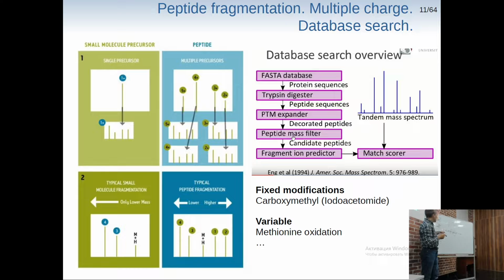Also, if you know that there are a lot of amino acids which have a really low chance of ionization, can we just skip them as improbable to be in our mixture, right? So we can compact our probable database just by using this. Of course, it's not a database that's stored on your hard drive. On your hard drive there is only the protein FASTA or nucleic acid FASTA, and this is done in the memory of your computer by software.